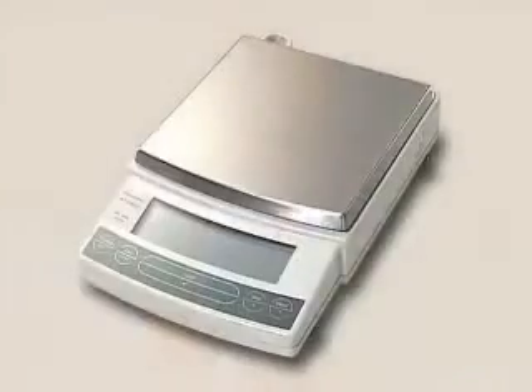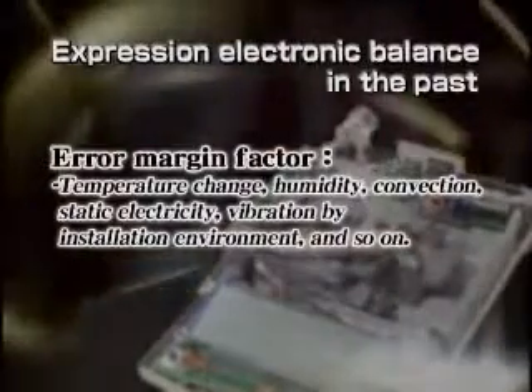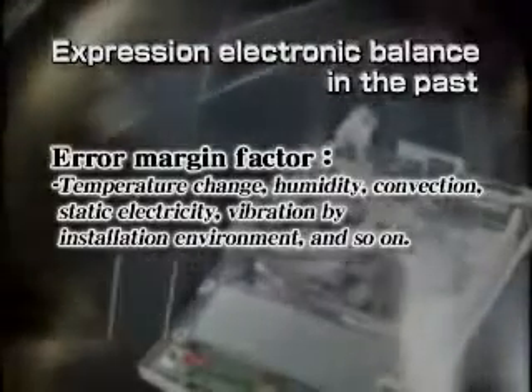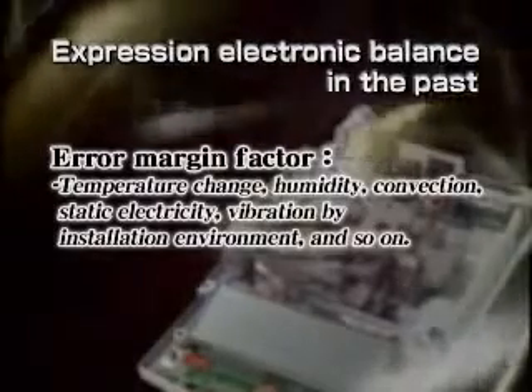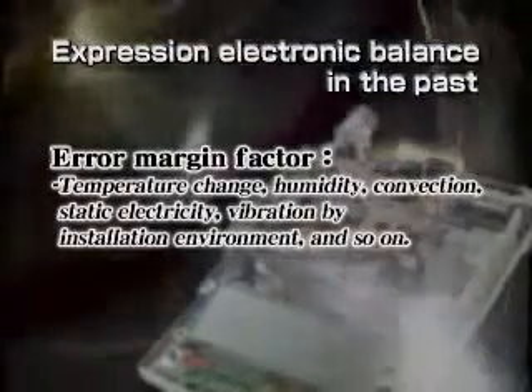This is what the inside of an actual electromagnetic balance looks like. A large number of fine precision parts are used to improve accuracy — that's why even the smallest thing can cause performance to change, ruining accuracy. Moreover, temperature fluctuations inside the balance itself, the temperature distribution between internal parts, or environment-related issues such as temperature, humidity, convection flow, static electricity, or vibration can result in errors. In one case, errors reportedly occurred in a balance installed on one of the highest floors of a high-rise building, simply due to the building swaying in the wind.